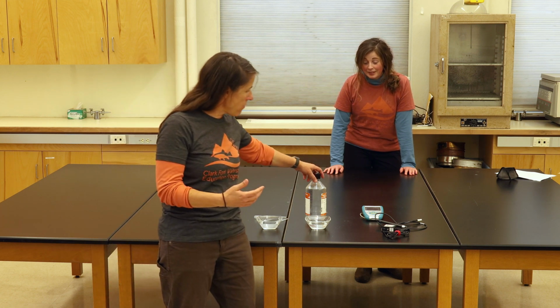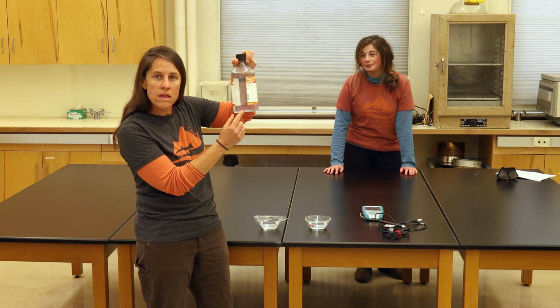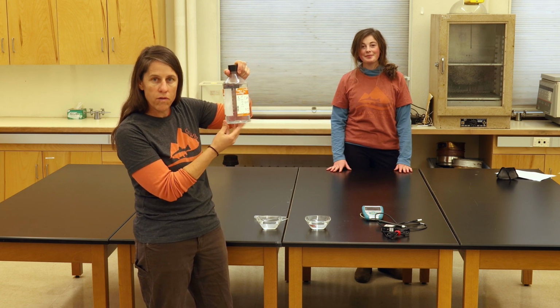Okay, we made it back from the field. Back to the University of Montana, where we'll be looking at conductivity of different solutions that are clear. They're see-through. You can't see anything in them, but chemically they're very different.